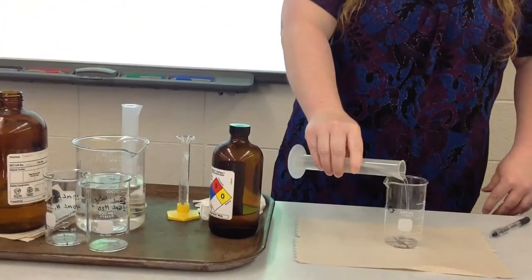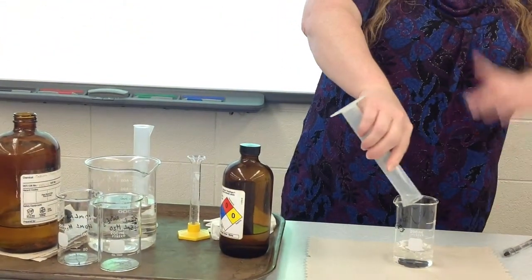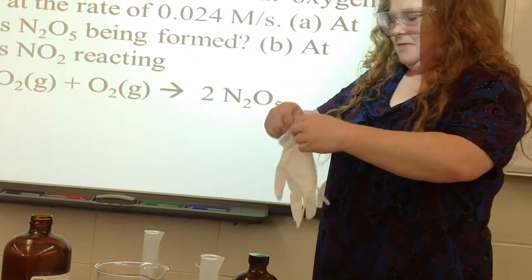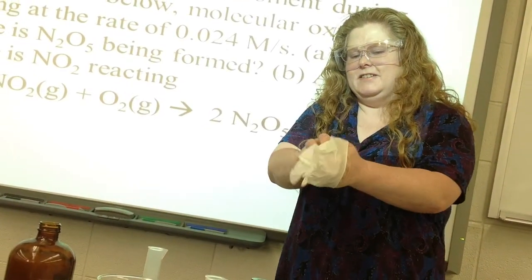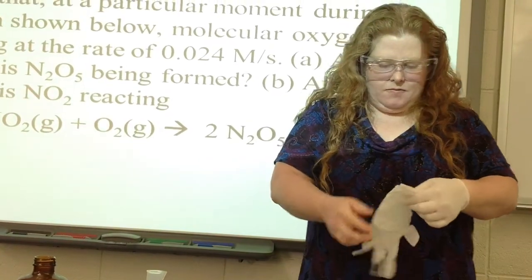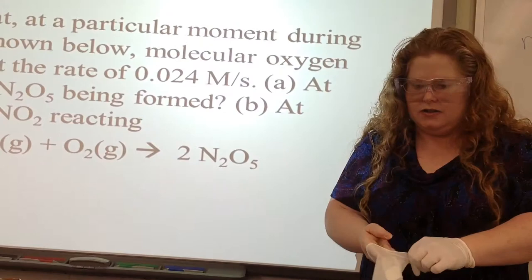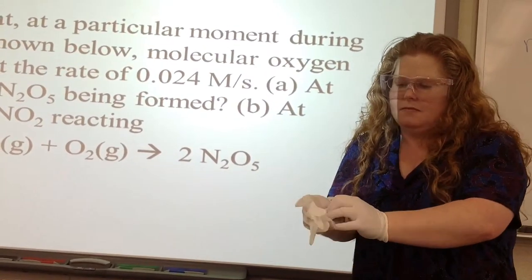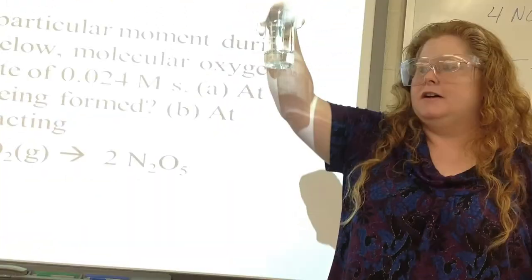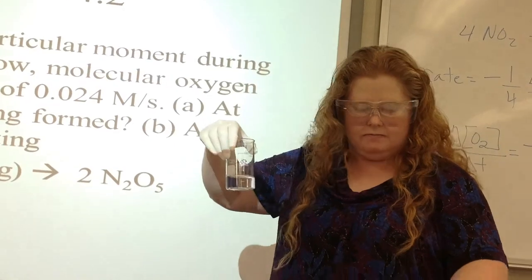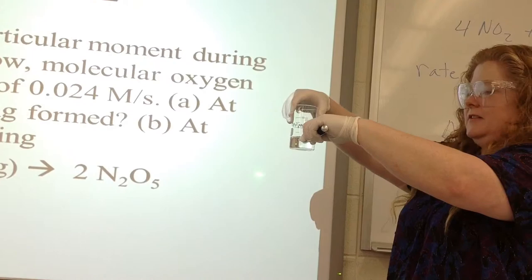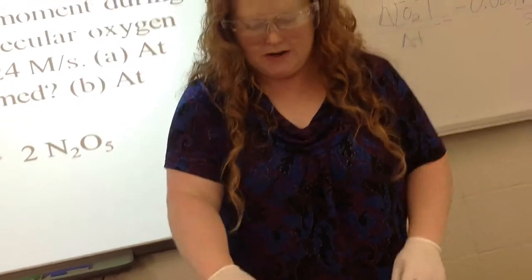So I'll just put that in the beaker. So I'll tell you when to start. Just make sure you can find the start button before I start. So I'll let you know when to start and then whenever this stops. But before I add the other reactant, the HCl, I just want you to notice that the solution itself is clear. You can see through it. If I take a laser pointer and it shines right through it, so you can see it up here on the screen. All right, so we'll see the difference when the reaction proceeds.